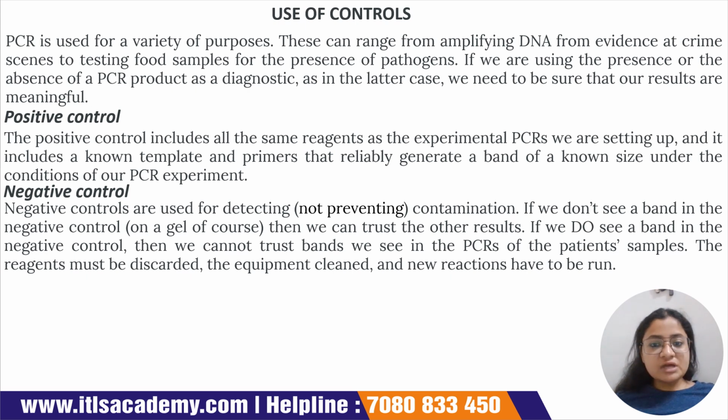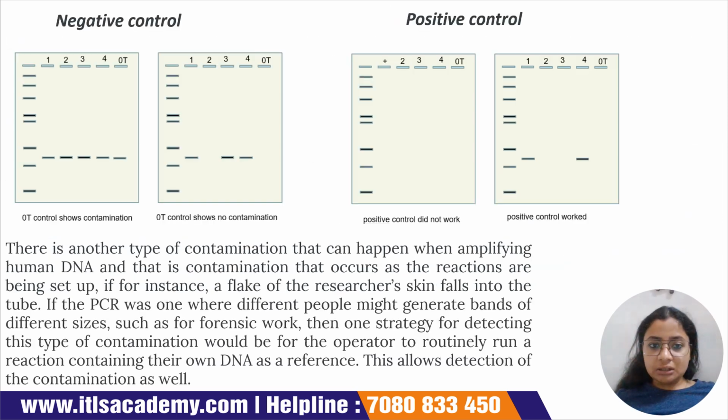So in that case we have to freshly prepare the reagents, master mix भी freshly prepare करना होगा, equipment को clean करना होगा, and फिर से हमें reaction run करना होगा. Okay, so see, यहाँ पे जो हम देख रहे हैं ये हमारा negative control है, that is the negative control. तो यहाँ पे negative control में भी band आ गया है, that means हमारा जो रिजल्ट है वो गड़बड़ है, कंटेमिनेशन है, हमें फिर से करना होगा, सब कुछ सही सलामत फिर से बनाना होगा, क्लीन करना होगा.